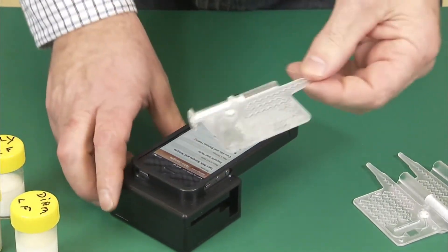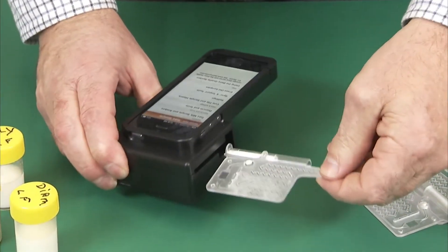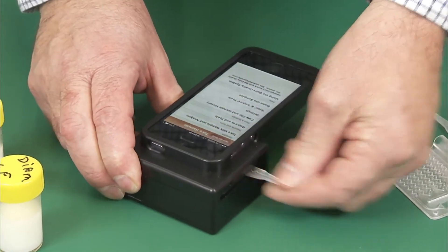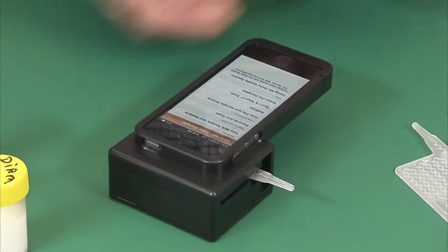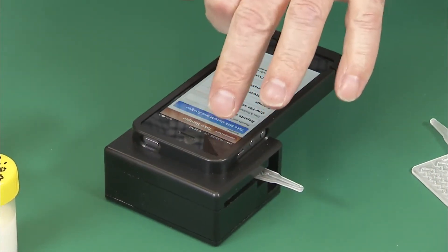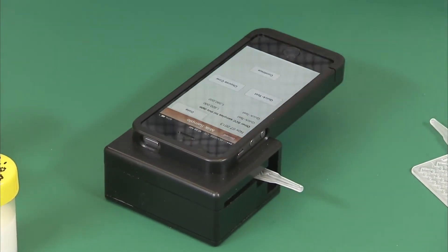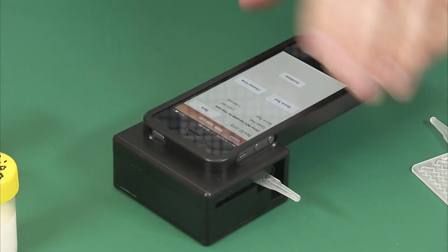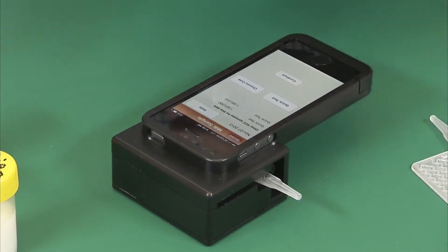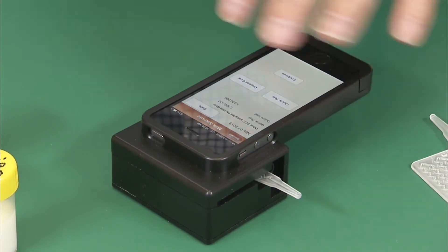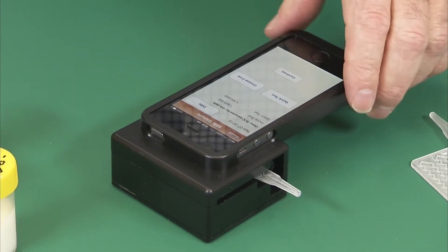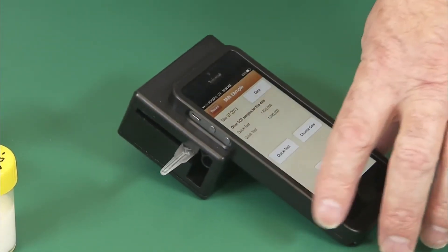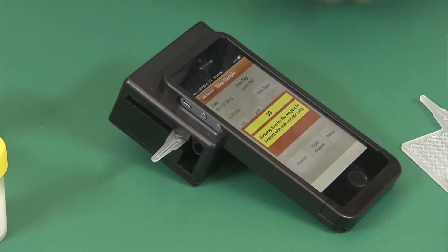We take the cassette and place it firmly into the dairy quality device. Now we open the app. We can choose a cow and the result can be saved for herd management files, but today we'll select quick test.